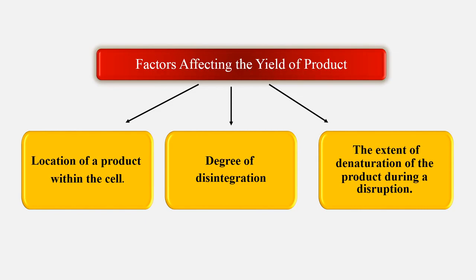بعض الجزيئات متحملة لدرجات الحرارة العالية، بالتالي فإن الحرارة المتولدة أثناء عملية التحطيم لا تؤثر على المنتوج ويكون المنتوج بإنتاجية عالية، في حين هنالك بعض الجزيئات الغير متحملة لهذه الدرجات، فإن ارتفاع بسيط في درجات الحرارة قد يؤدي إلى تمسخ هذه الجزيئات وفقدان كمية كبيرة من المنتوج خلال عملية التحطيم.